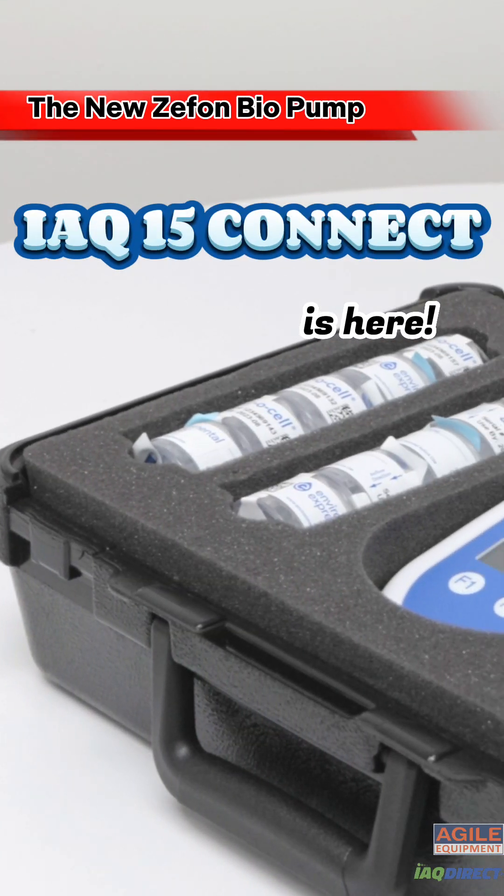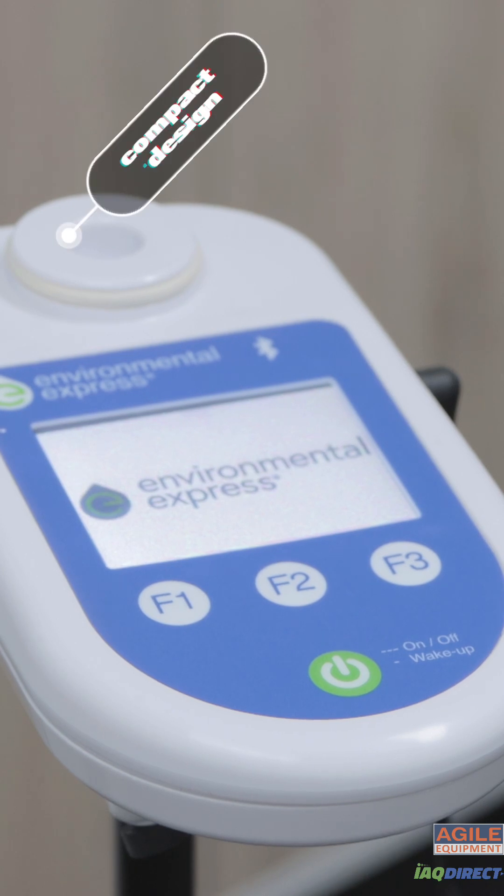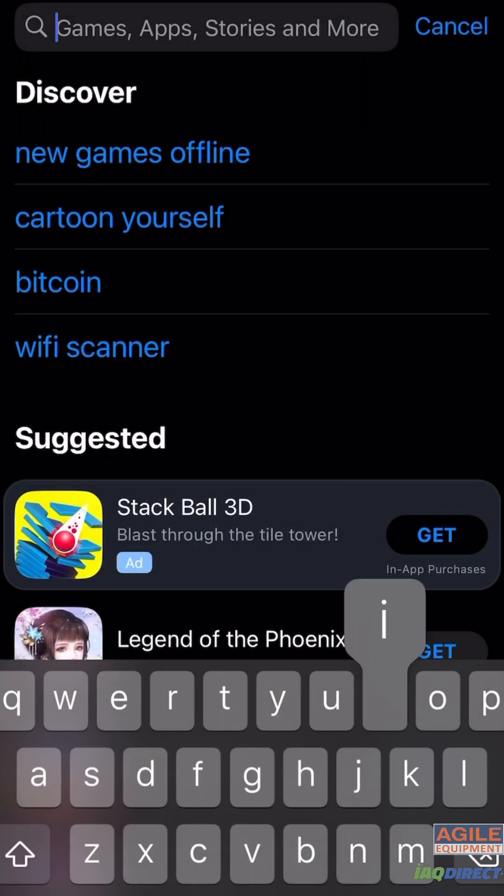The iQ15 is the long-awaited follow-up to the popular Zefon Bio Pump. Featuring a new compact design, colour screen and long-lasting battery, the iQ15 makes the perfect mould sampling pump.